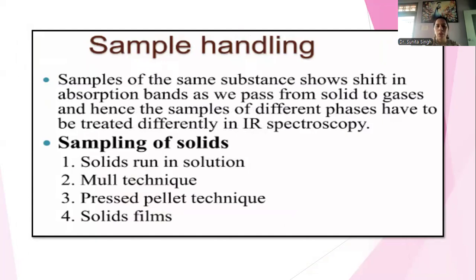For solids, we have solid run in solution, mull technique, pressed pellet technique, and solid films. Samples of the same substance show a shift in absorption band as we pass from solid to gases, and hence samples of different phases have to be treated differently in IR spectroscopy.